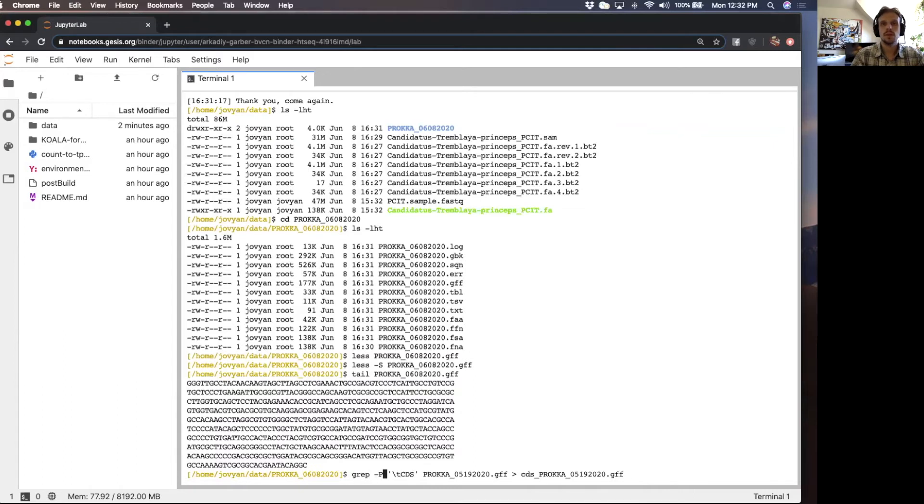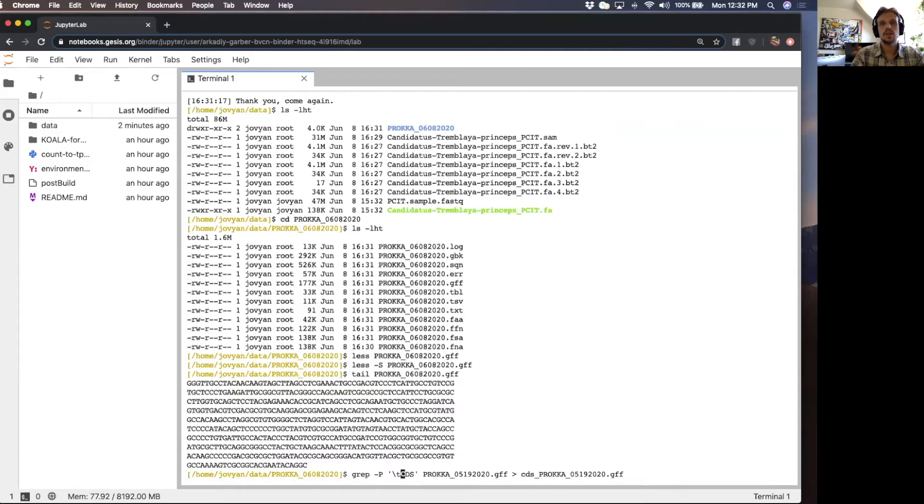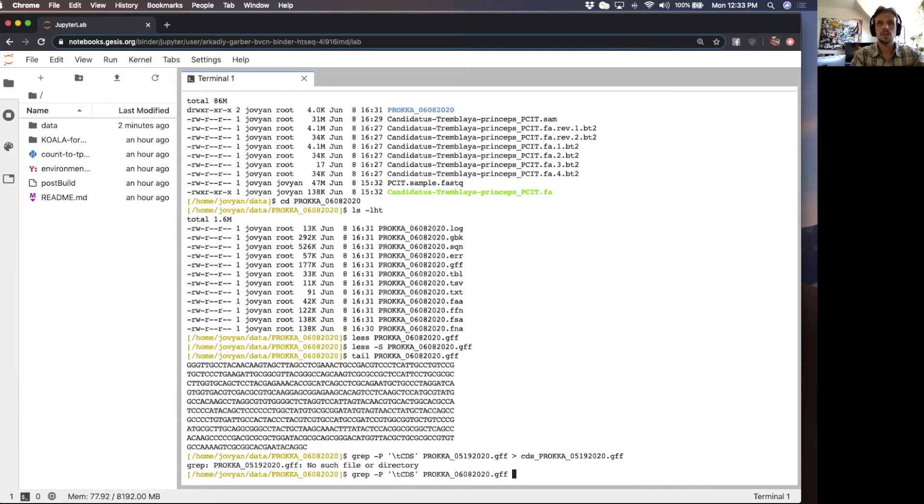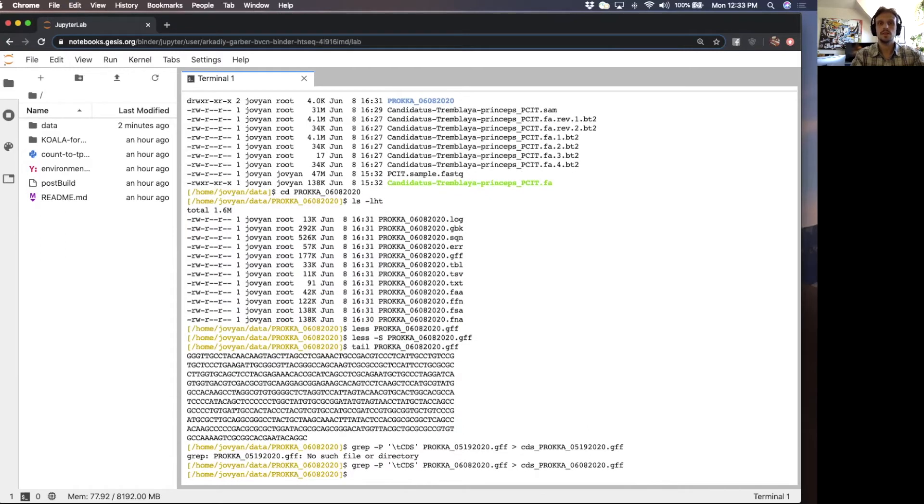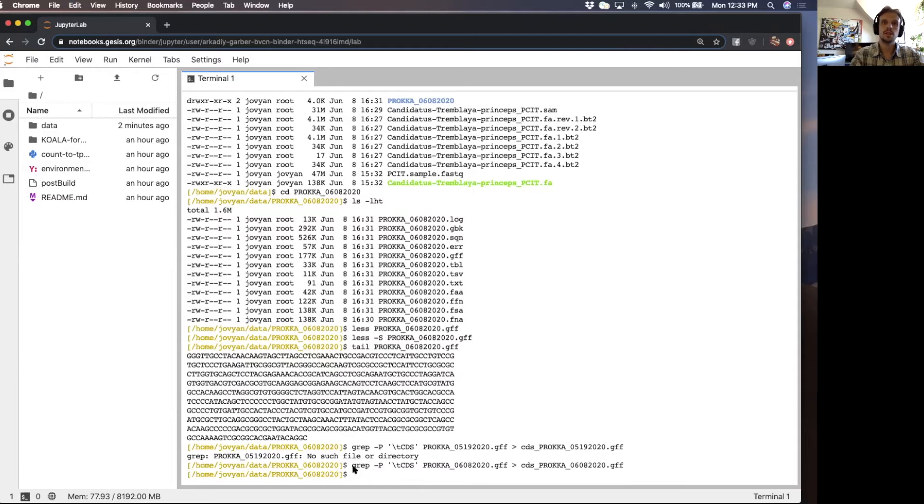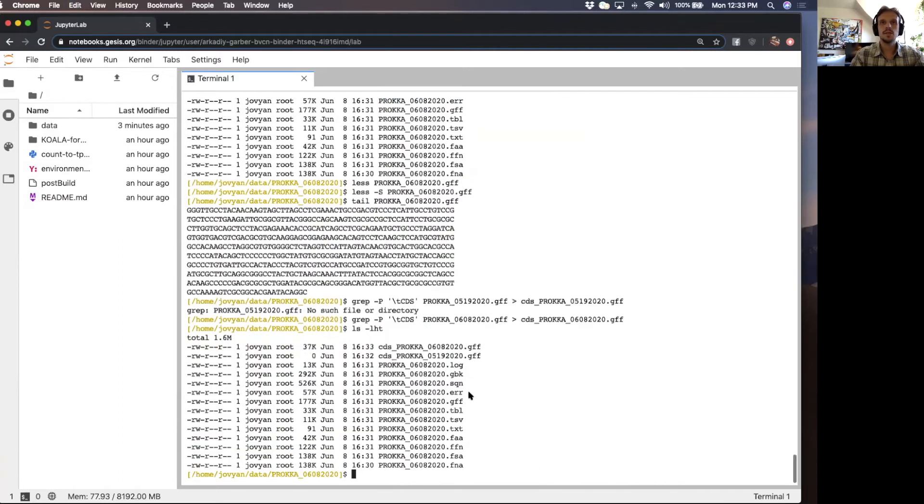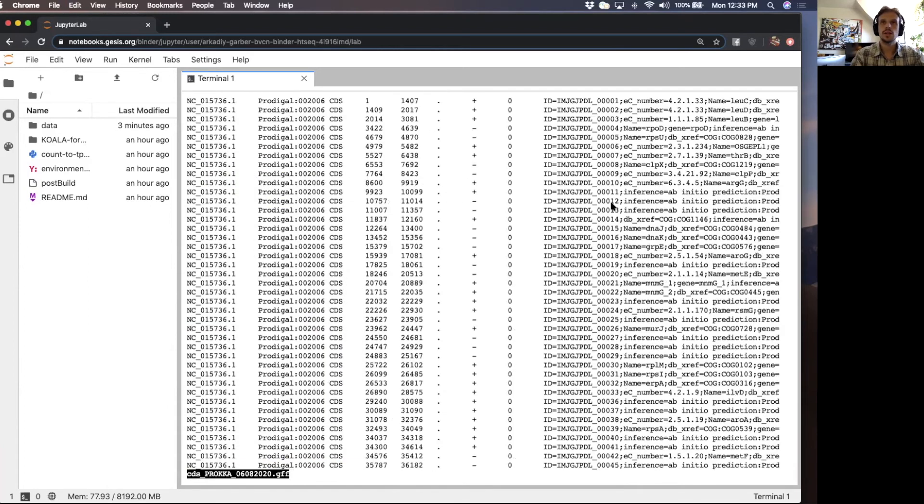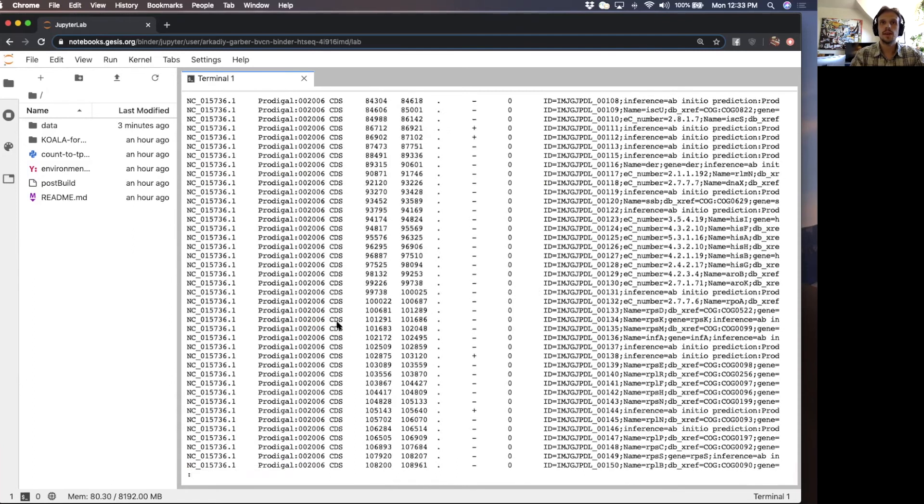For those unfamiliar with command line, grep is a very nice tool that allows you to pull out certain lines from a file that match certain string characters. In this case, it's a tab then followed by CDS. So we're going to pull that out. I guess I wrote this tutorial on May 19th. We're going to rewrite this a little bit and run this. If you want to learn more about command line and all these cool tricks, I recommend going over to Mike Lee's website, Happy Belly Bioinformatics and you're going to learn a lot.